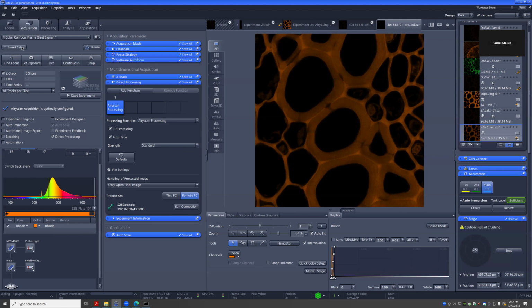I have a quick question, Julia. We were talking earlier about the root's 3D, right? So we need to go in the middle often to see. So in this sample, it's pretty flat, right?